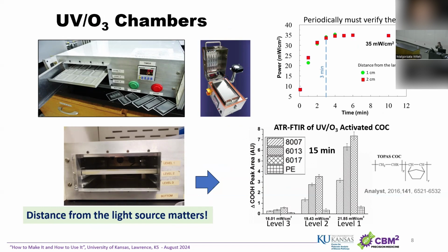Different setups, even the commercial ones, you'll see that there are different positions from the light source. And again, I want to caution you that it's really important to pay attention how far from the light source you're going to position your sample. Because you can see here the data we published.